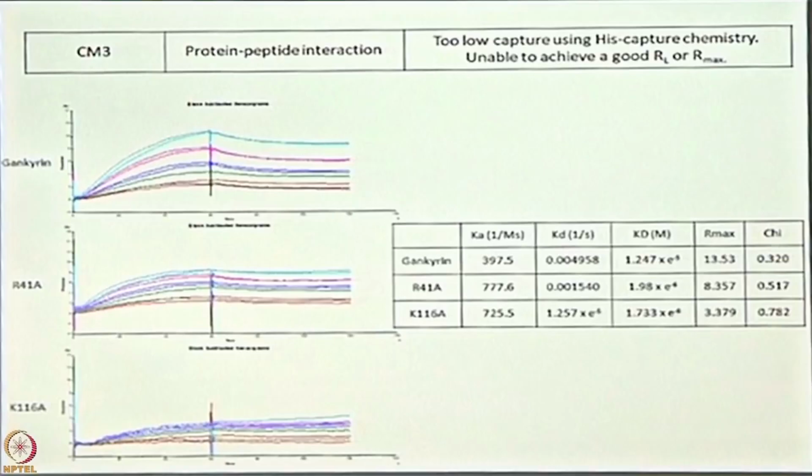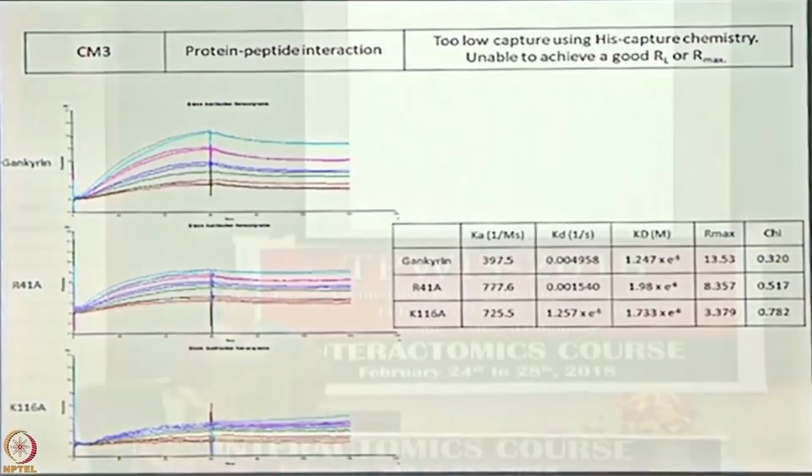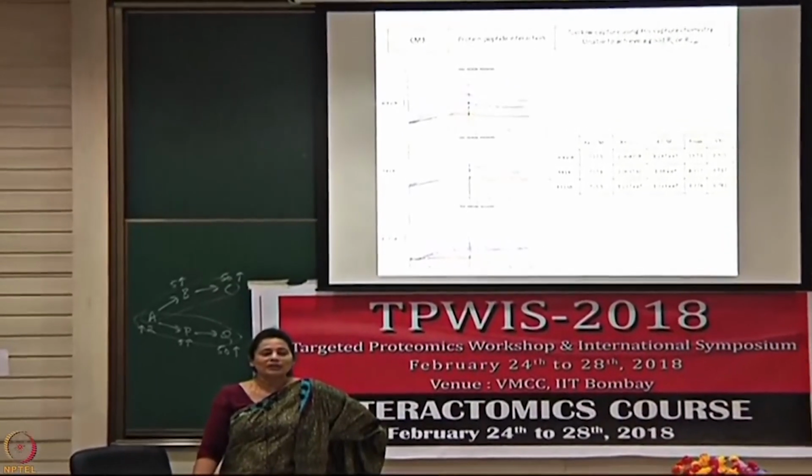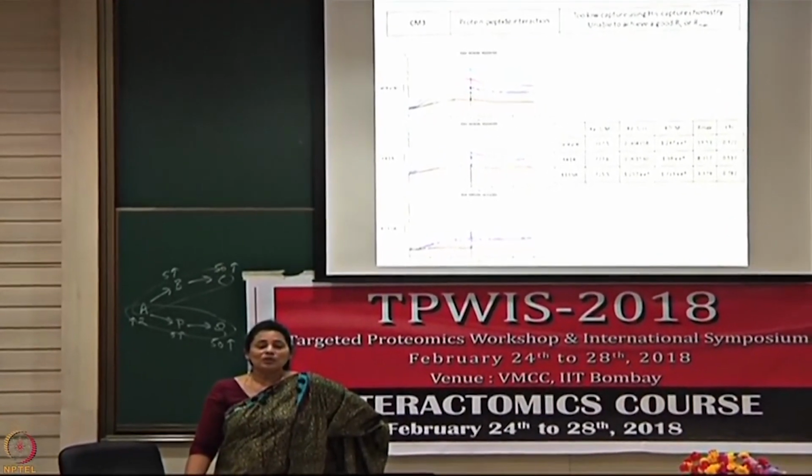Is dissociation critical? I already got this. Why do I worry about the dissociation? I just flush, get all the analyte out of it. Should I wait for the dissociation to happen? Why is dissociation important?